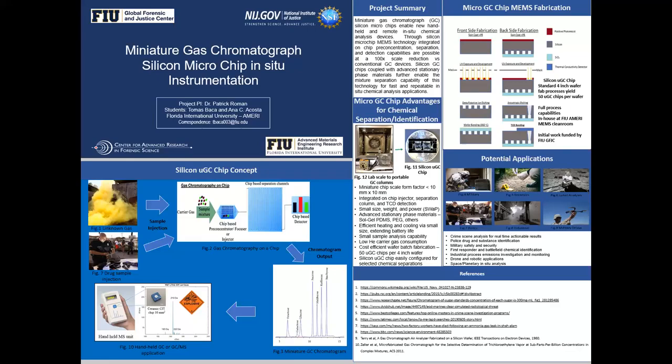That makes sense. I've seen designs for microfluidic devices, which obviously are not carrying gases but fluids, and have different issues, with surface tension, etc. But do you know about how long this channel is when it's etched onto the chip? Currently, we've decided on making it 3 meters, but other people do different sizes just based on how they chose to design it. As of now, we don't know whether we should scale it up or scale it down. I think scaling it down wouldn't do us any good. The longer, the better. But for now, our current designs we're looking at 3 meters.